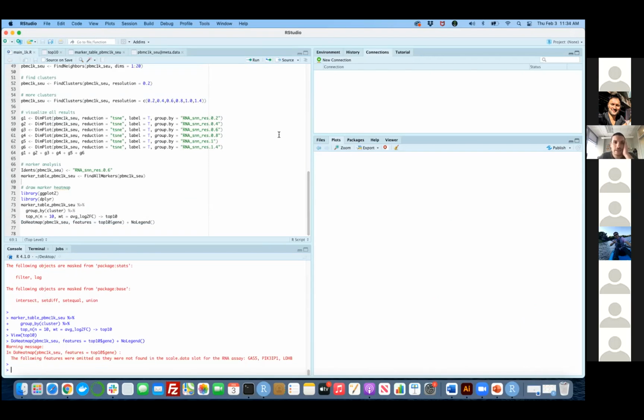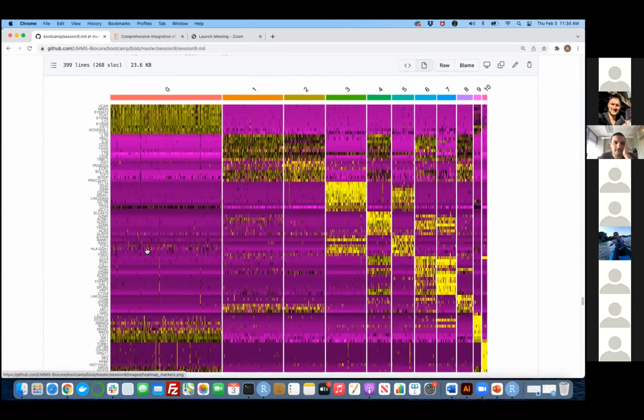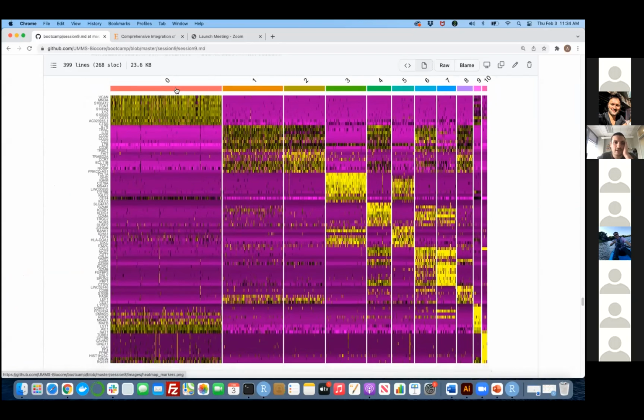The heat map may take some time to render, so we may have to wait a little bit, but eventually it's going to visualize. But you have something like this as a result, if you wait. If the color is yellow, it means the expression of this gene in this cluster is quite high, which indicates that these genes are unique to this cluster, because as you can see along the row, as compared to all other clusters, none of them are up.